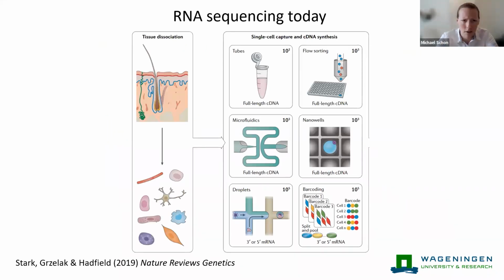And in parallel to these developments, there's actually been an astounding amount of miniaturization for these methods in the form of single-cell sequencing technologies. I can't go into all of the methods that have been developed, but in recent years, single-cell sequencing has really taken off, and we now have many different methods to isolate RNA from single cells, barcode them, and then sequence them as a large library without losing the information of where each RNA came from, which cell each RNA came from.